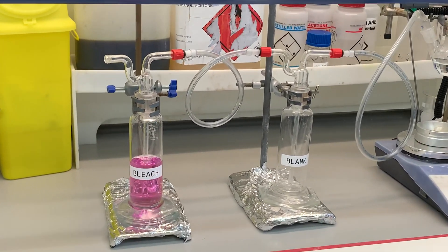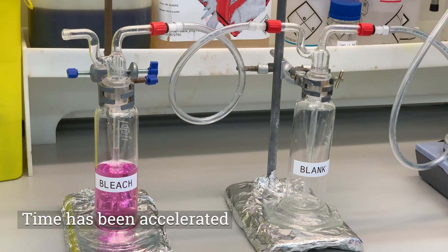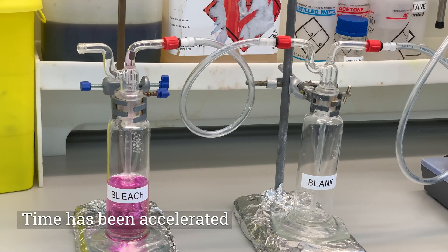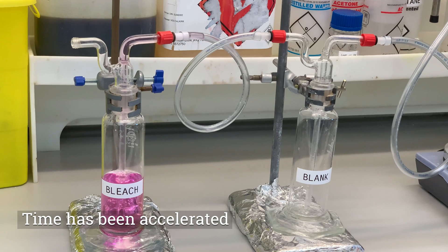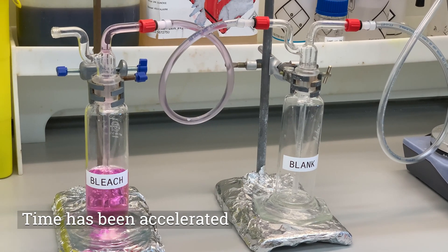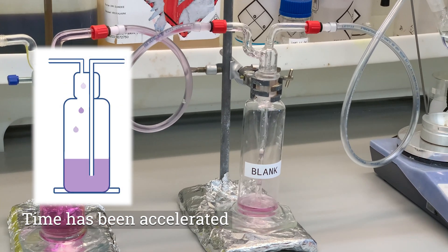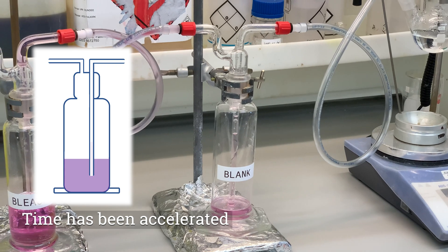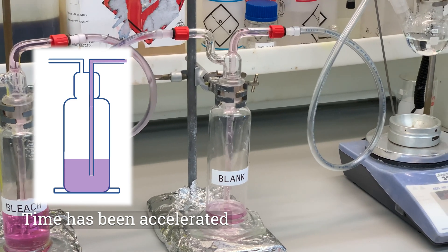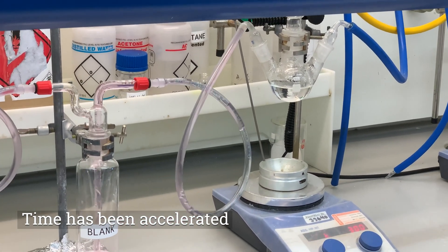Watching the bleach chamber, we start to see suck-back quite quickly as it fills up the internal tubing. Once it enters the blank chamber it starts to fill up the down pipe quite quickly, and as time goes on that solution goes back through the internal tubing and into the reaction mixture.